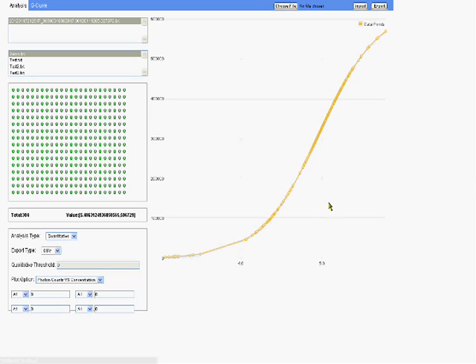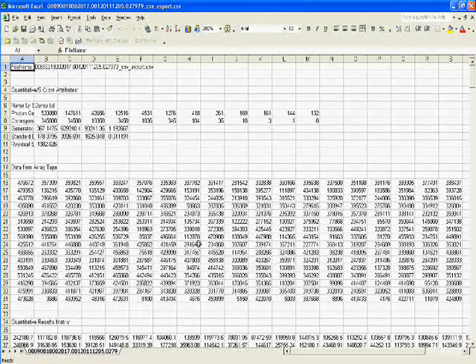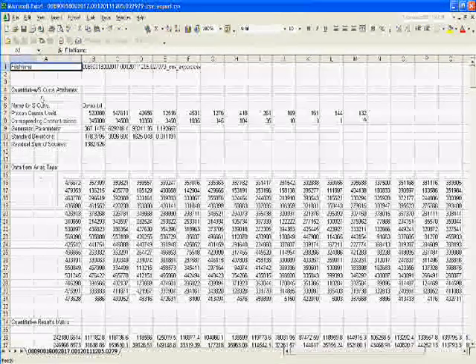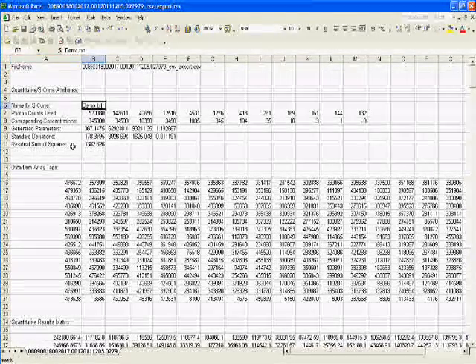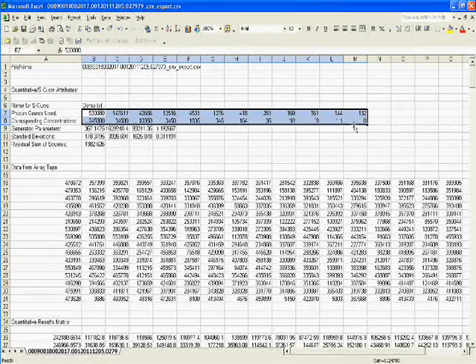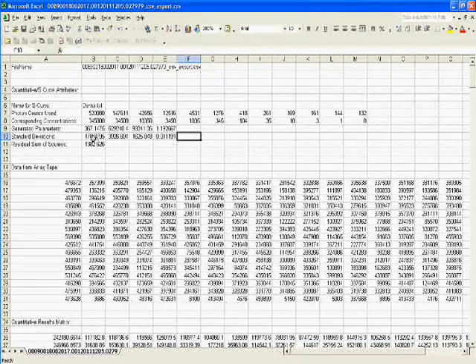and this will generate a file for you. And once it's downloaded, you can open it up, and it'll show you the file name here, you can see the S-curve attributes that we set. So we use the demo txt for our S-curve. These are the control values that were from the S-curve, and you can see the generated parameters. There's 4 here because this particular file is the 4-parameter logistics. If you pick the 5, there'd be another value right here, as well as there. And these are the standard deviations of those, and then the residual sum of squares.